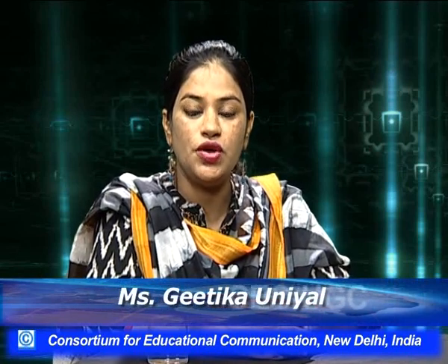Dear friends, in this session we are going to talk on UV visible spectroscopy. We already had one session on the following topic, and continuing further we are going to give you more knowledge on UV visible spectroscopy. Friends, for the discussion on the topic we have with us in our studios Professor Sanjeev Kumar, from School of Sciences, Indira Gandhi National Open University.